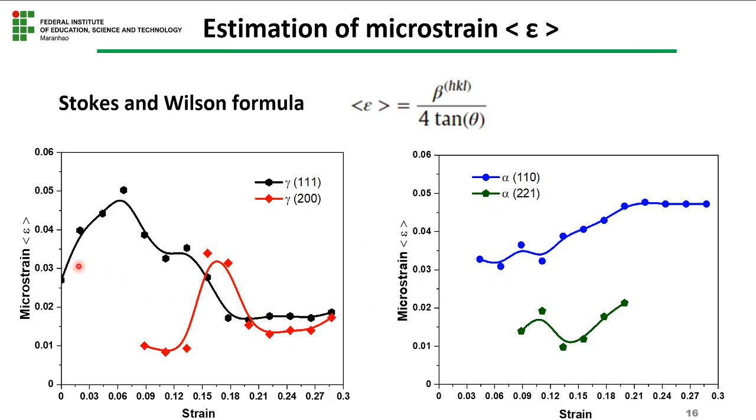It means that the austenite work hardened and afterwards suffered softening behavior due to DRX, while the ferrite starts to appear during the deformation and suffers work hardening, but not as intense as the austenite phase field.